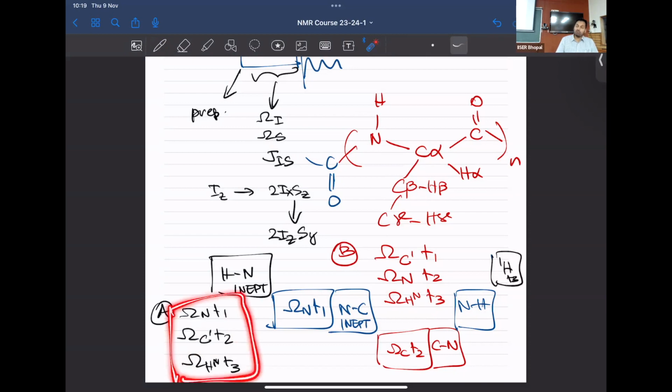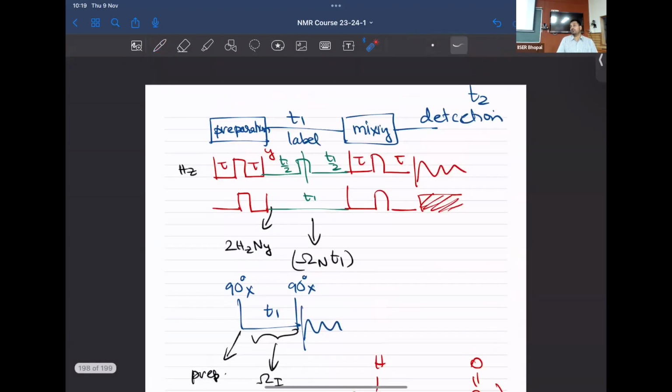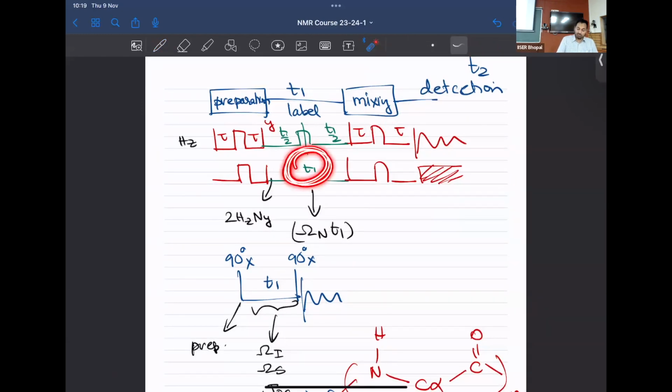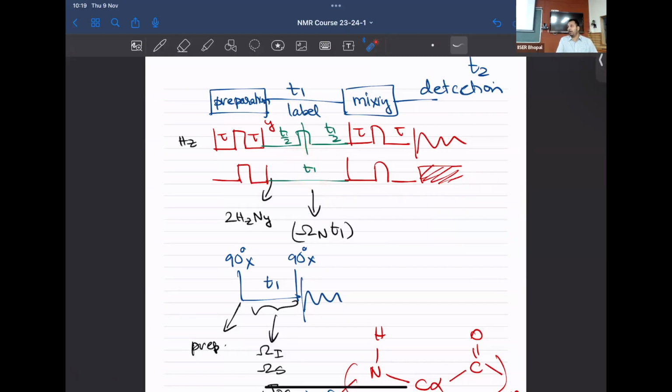Predominantly, we would take route A because we already have a high resolution proton nitrogen correlation from the HSQC. The HSQC already gives you a very high resolution. What do we mean by high resolution? The T1 max, the acquisition time on the 15N dimension, determines resolution in the indirect dimension, right? Between 2D and 3D experiments, which experiment would you prefer to have a high nitrogen resolution, 2D or 3D? Sorry, why? You said 2D, but why?